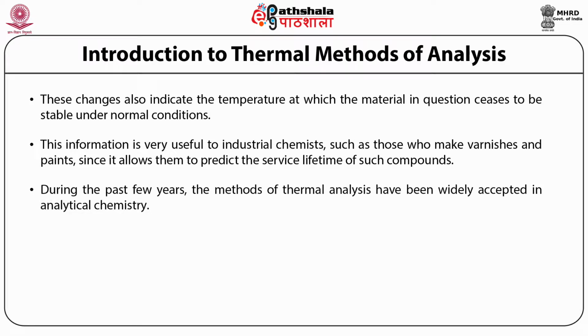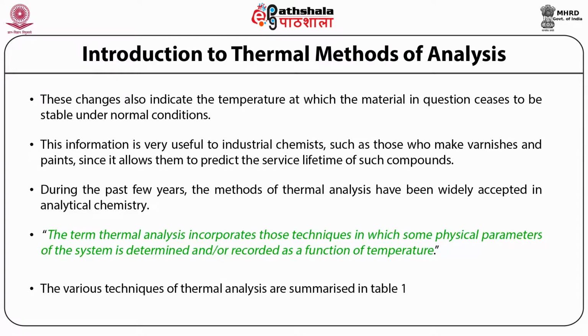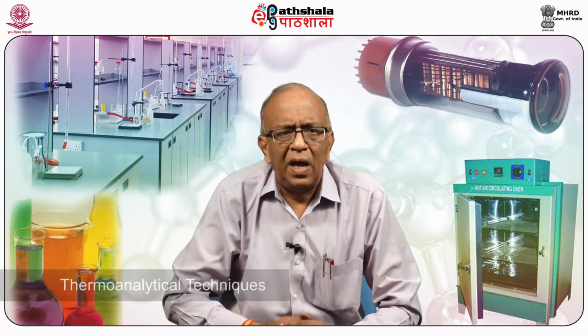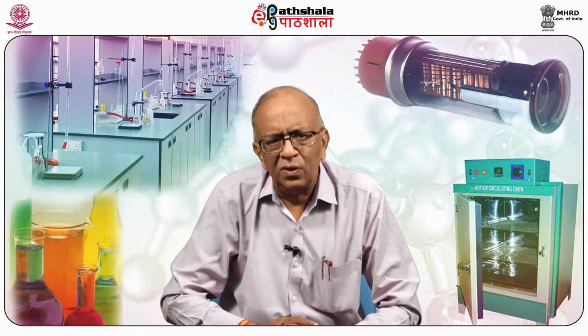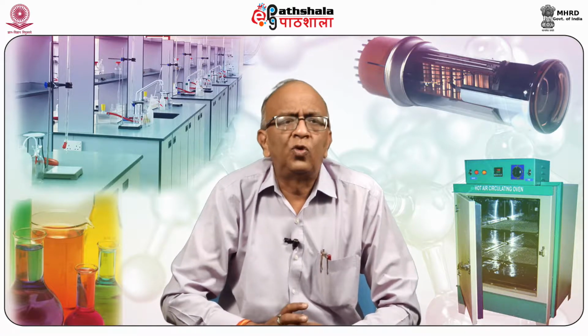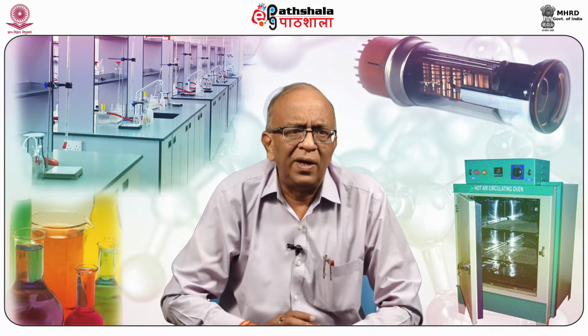During the last few years, the methods of thermal analysis have been widely accepted in analytical chemistry. The term thermal analysis incorporates those techniques in which some physical parameter of the system is determined or recorded as a function of temperature. The various techniques of thermal analysis are summarized in Table 1. Thermoanalytical techniques are a group of around 10 to 15 techniques, based upon the instrument employed for measurement and also the parameter which we are studying.